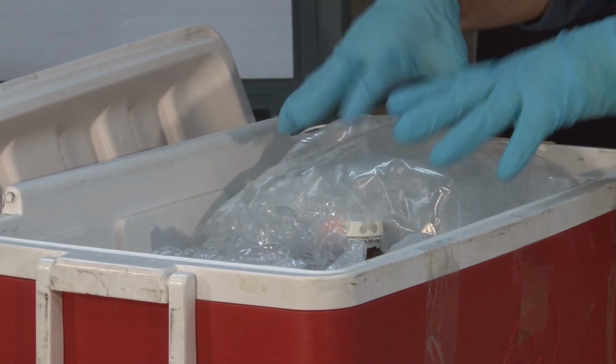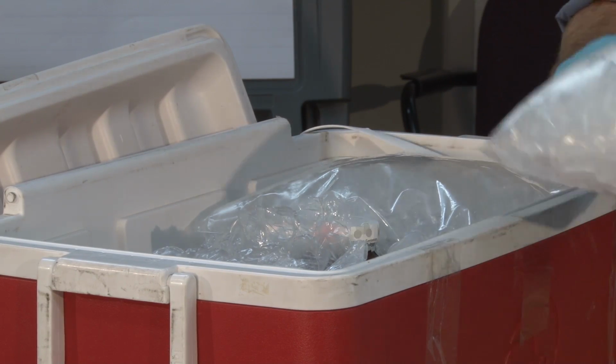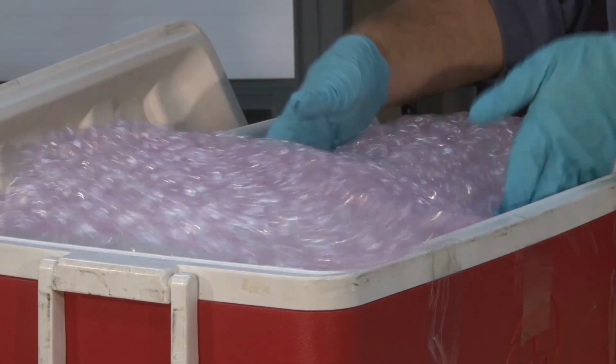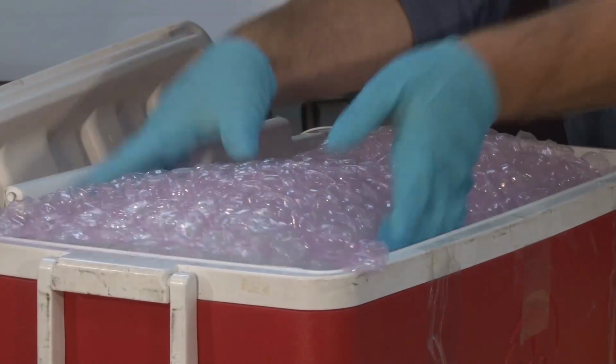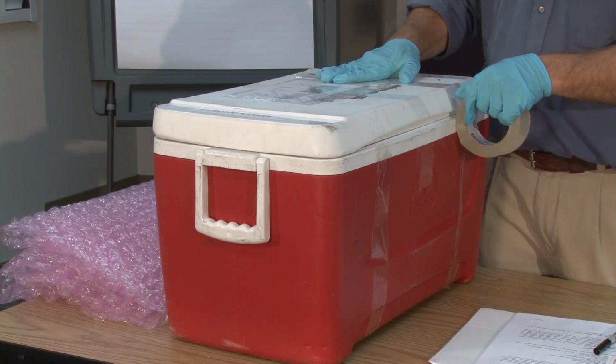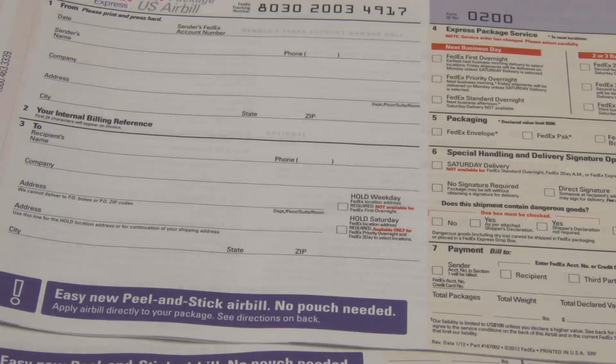Pack the ice into the resealable bags and place it into the cooler. To avoid leakage, take care in packing the ice. Fill any spaces with extra bubble wrap. Close the cooler and secure it with tape. If you are sending more than one cooler to the same laboratory, number each cooler. Apply the shipping label and ship the cooler to the designated laboratory via overnight delivery service.